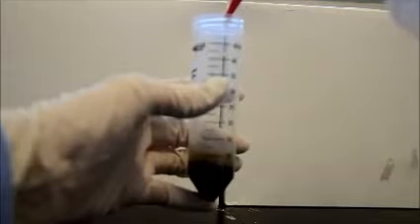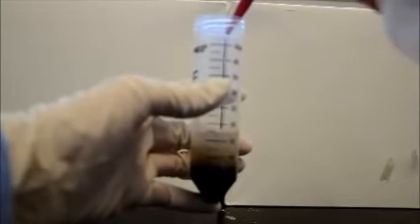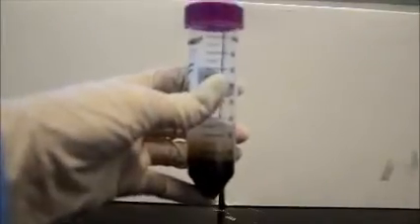After stirring for an hour, we transfer the iron oxide sample to a centrifuge tube, and then add 10 milliliters of acetone to wash. We centrifuge it at 11,000 rotations per minute for 4 minutes. Then we remove the supernatant and add 2 milliliters of water and sonicate.